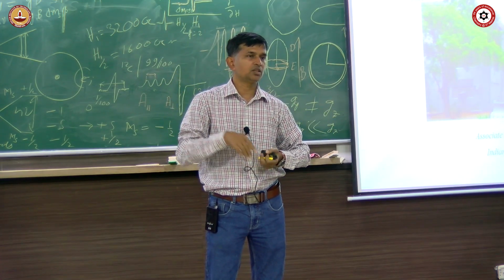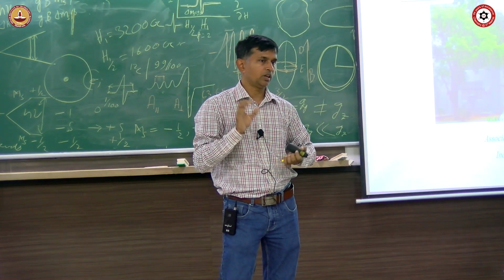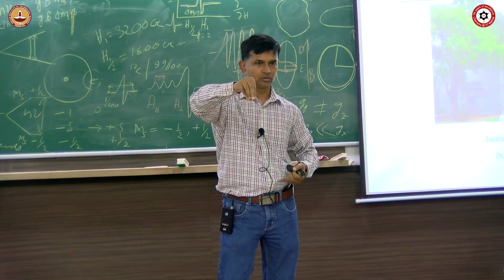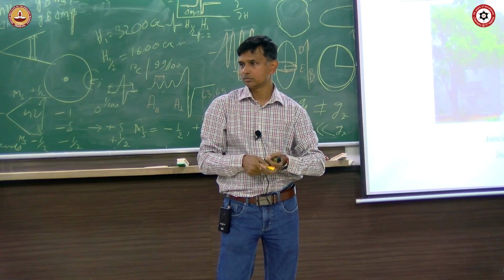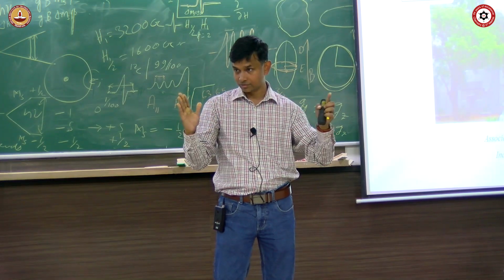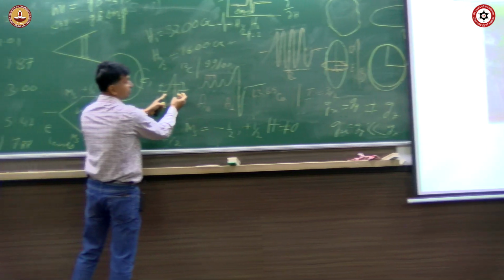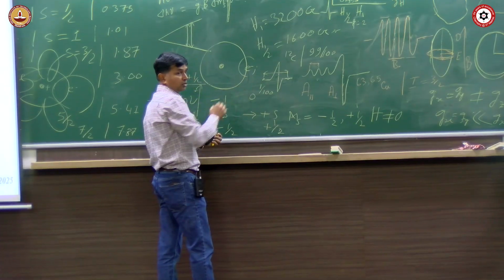If the spin density is mostly on carbon, you will get some amount of spin density on each carbon also, but the value will be less because the same electron density is distributed over 6 carbons. So the coupling constant will be smaller. How much electron density you put on each carbon matters for the splitting. More electron density means they will be farther apart, and lower intensity means they will come closer. Sometimes they fall under the main signal and you are not able to see them, or they are too noisy and not detectable.